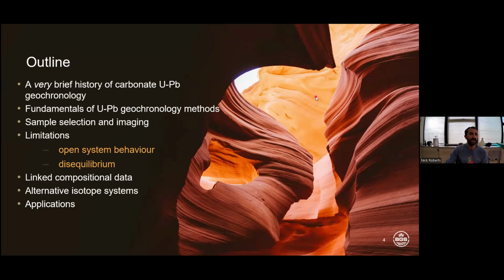So in this seminar, we're going to cover a very brief bit about the history of this method, and some of the fundamentals of the methods that we're using. This talk is mainly going to be about laser ablation, LA-ICP-MS. We'll look at some of the techniques and methods we can use in characterizing our samples, some of the limitations of the methods, some of the data that helps us interpret ages, and quite a bit on applications as well.